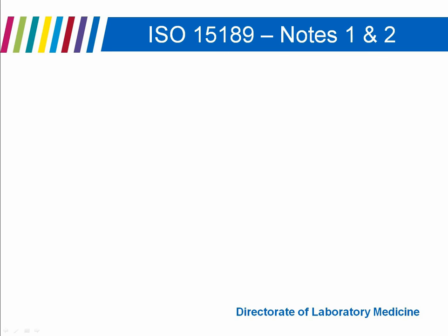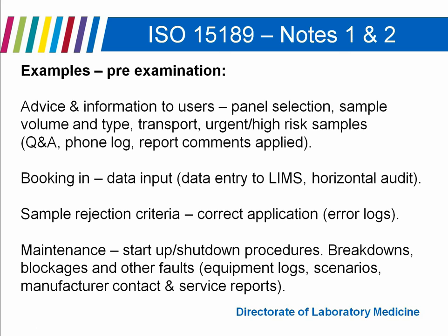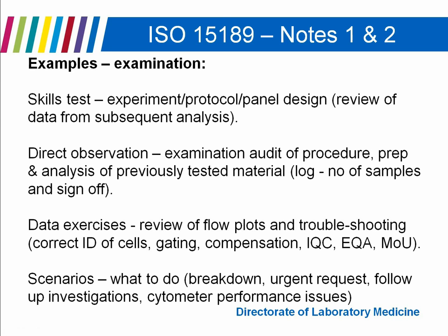Then, if we just quickly look at some evidence, can the individual select the correct panels? Can they input data correctly? These are all things that we would want to cover. Do they know what to deal with if you have a breakdown or a blockage or other faults with the instrument? Do they know how to design an experiment, set up a protocol, run a panel and review the data from that panel?